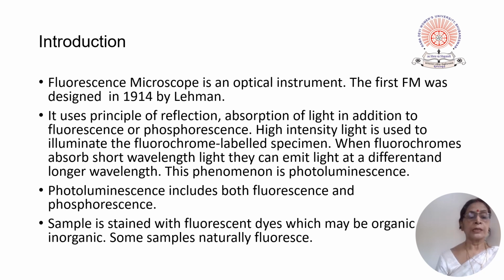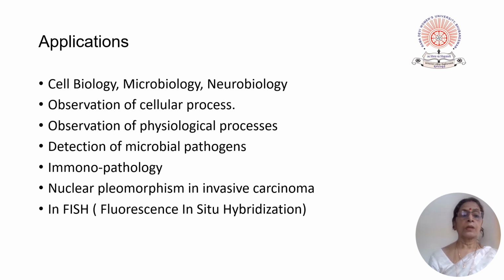Fluorescence and phosphorescence are part of photoluminescence phenomenon. The fluorescent dyes may be organic or inorganic in nature. Fluorescence microscopy has several applications.